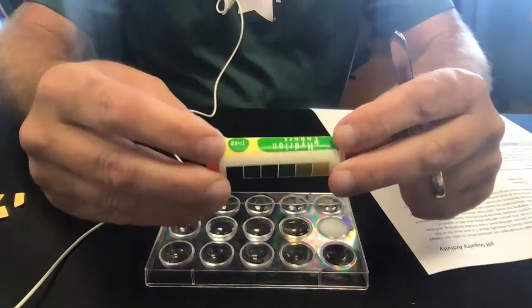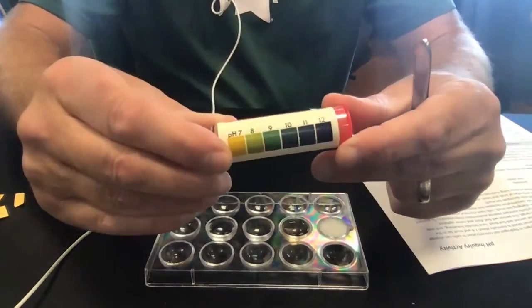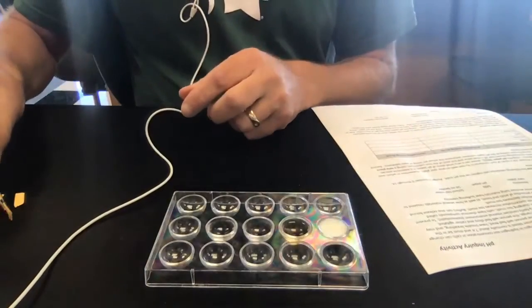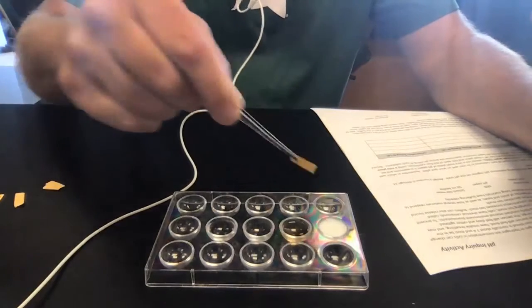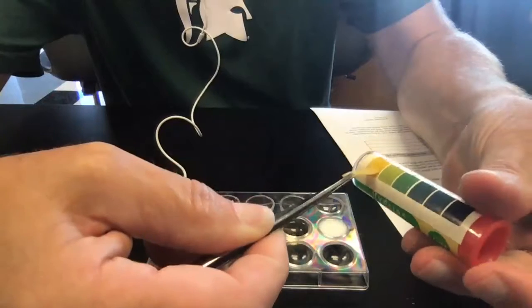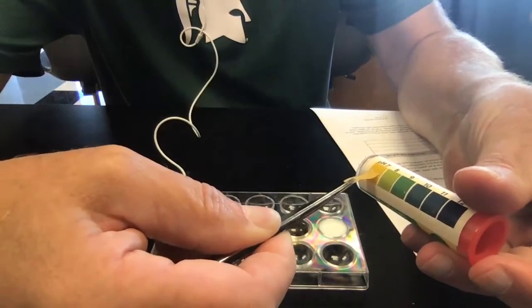So I'm going to take some pH paper. You've probably worked with pH paper before. You put it in the solution, it turns color, and then you match the color to the scale. And that gives you the approximate pH value of what you're looking at. So milk, if I go in with my pH paper, a little strip of pH paper, I'm going to put it into the milk. Let it sit for a moment, bring it out, give it a moment to change color. And you can see that matches up to pH 7 pretty darn well. So milk actually has a neutral pH, pH 7.